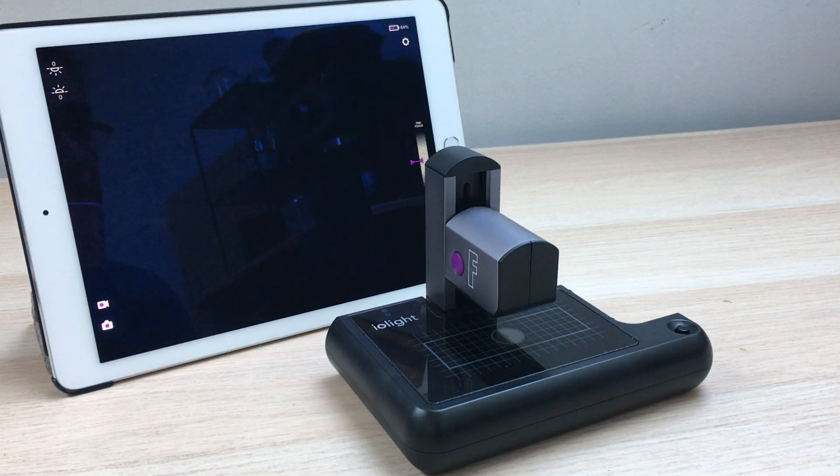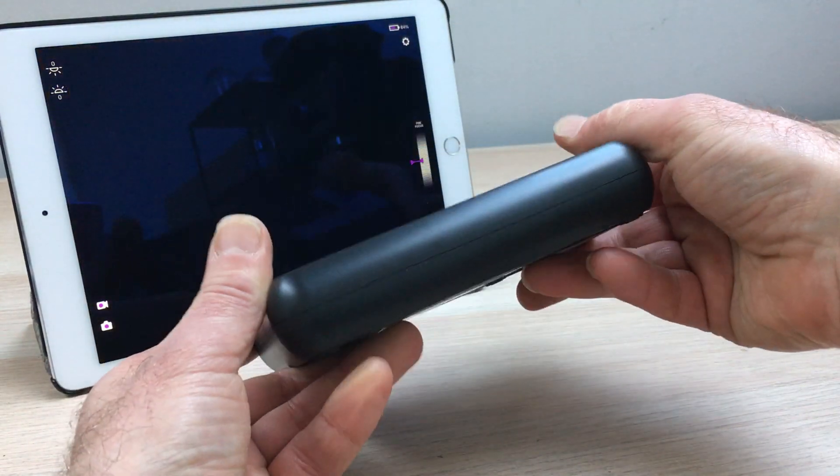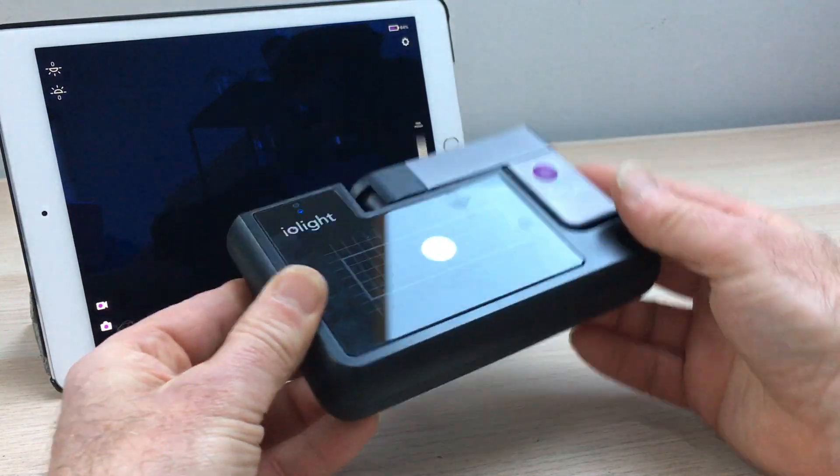Hi, this is Richard from Iolite. I'd like to show you our portable fluorescence microscope. The microscope is very small and compact — it folds to fit in a jacket pocket or a small bag.